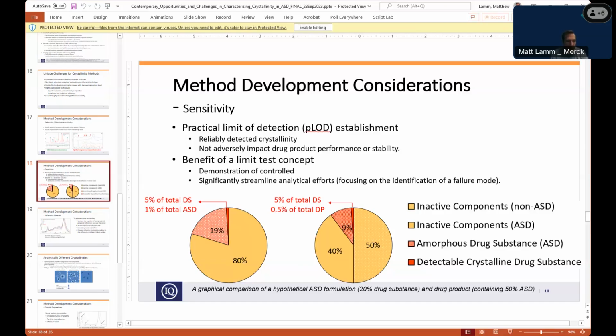Can you talk a little bit about blending and preparing those standards for method robustness and some of your experience? Yes, there can be a few lab scale methods that can be used. One approach can be a shaker mixer, like a Turbula mixer, that can also be used in a lab scale to mix these. And homogeneity of these calibration samples is critical, as also evident from the presentation that we just had.